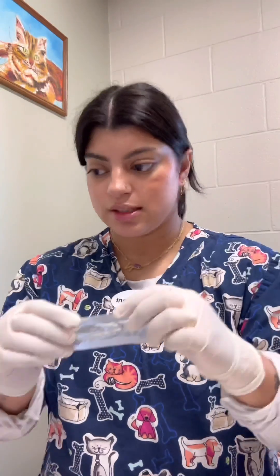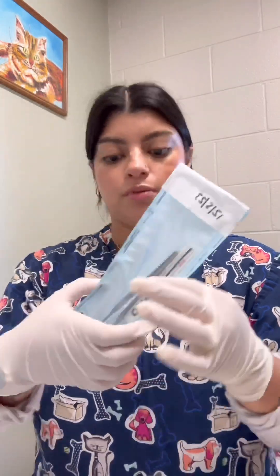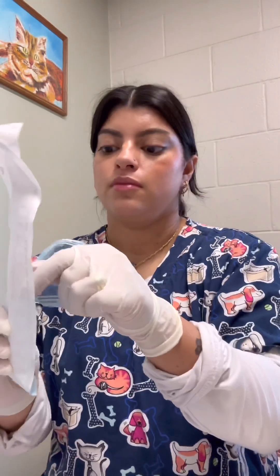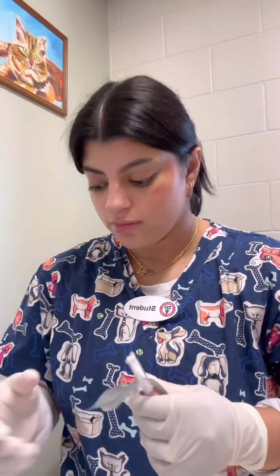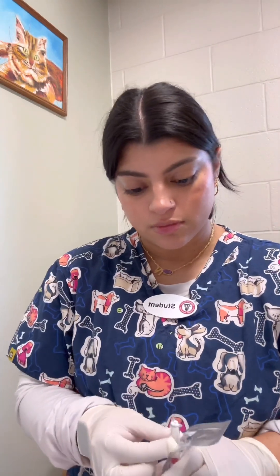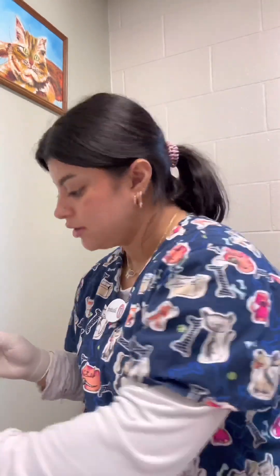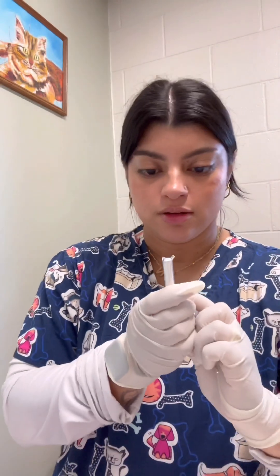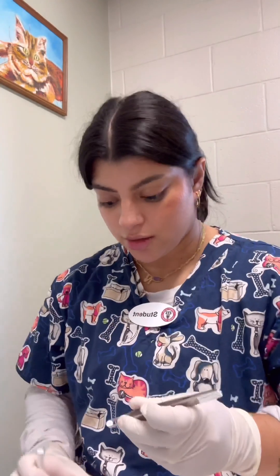Now that I have my sample on the Agar plate, I'm going to be using the antimicrobial discs. We have the discs over here, and I'm going to be using some sterile forceps so I can pick them up and put them onto the plate. Now when I'm placing these onto the plate, I want to make sure that they are no closer than 10 to 15 millimeters of the edge of the plate. Using my forceps, I'm just going to gently grab one and put it into my Agar plate, onto the surface.